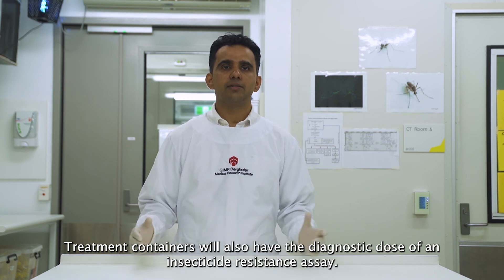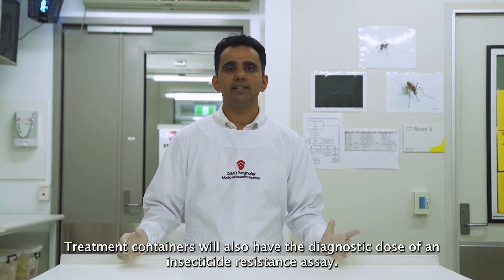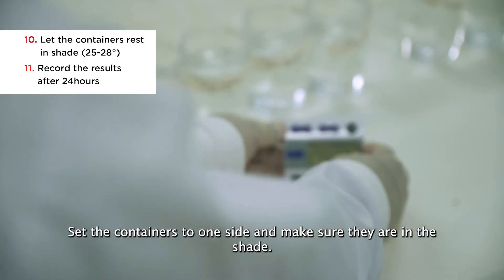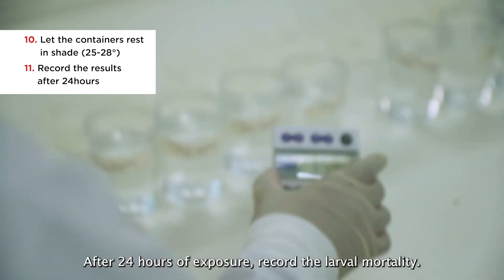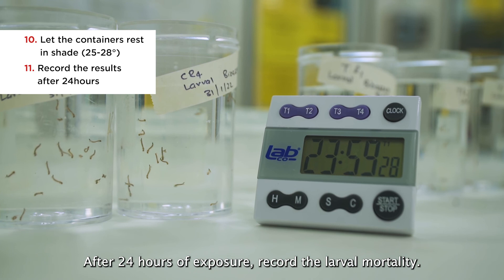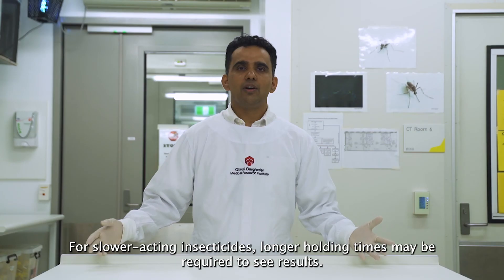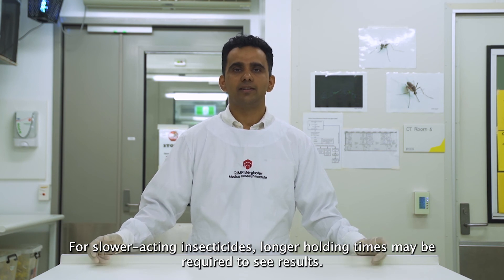Treatment containers will also have the diagnostic dose of an insecticide resistance assay. Set the containers to one side and make sure they are in the shade. After 24 hours of exposure, record the larval mortality. For slower-acting insecticides, longer holding times may be required to see results.